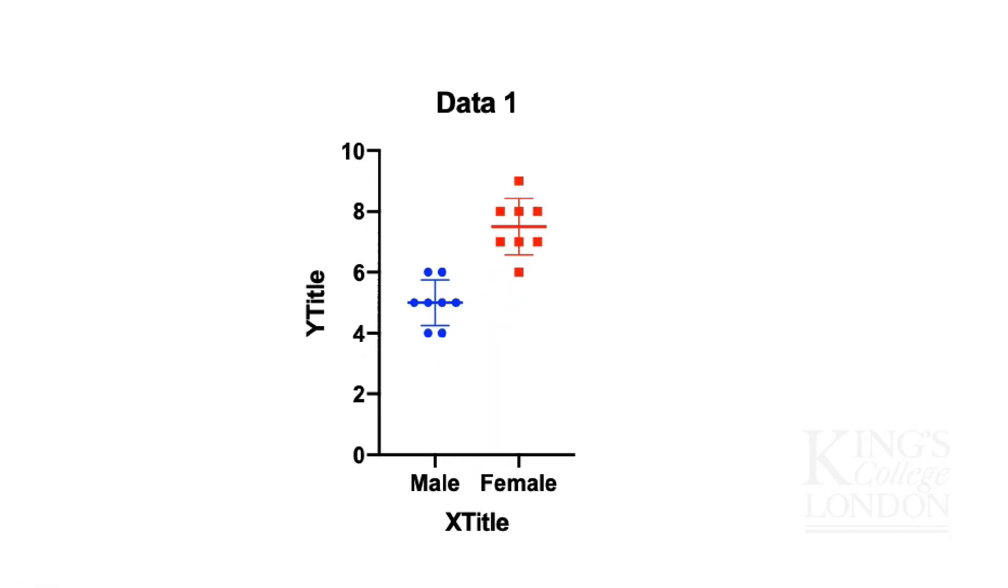Since we're not presenting these data I'm not going to spend any time formatting this graph but it is worth just observing that these two groups do appear to have a difference between them. Despite the fact I've randomly selected this data I was biased in selecting higher numbers for the female group than the male group.